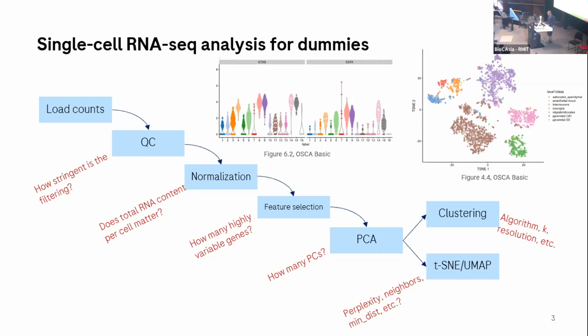So basically what this means is that many people will repeat the analysis multiple times across several iterations in order to settle on a result that best addresses their scientific question. So these single cell analyses are often semi-automated. You can mostly run them in an automatic fashion, but there are times where you have to have manual user intervention to fine-tune some parameters depending on what your question is.